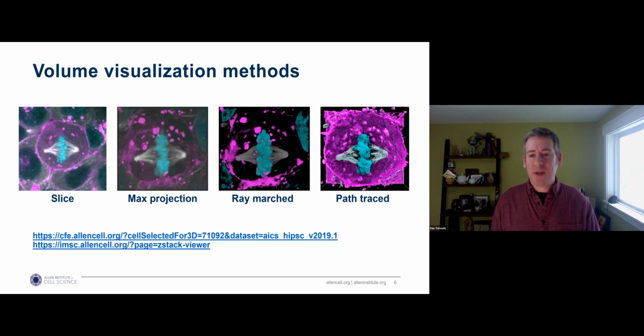And these 4 approaches I'm going to talk about, they all exist in many different volume viewers, but I'm going to describe them in the context of the tools that I have developed for Allen Institute data. One thing to note about volume data that's common to all of these approaches is that the intensity values captured are generally spanning a large dynamic range, and they can also be noisy. There can be non-zero intensities in areas that are not the thing we are actually trying to image or that we care to look at.